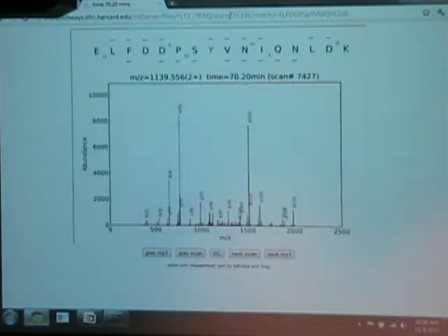Thanks. Can you distribute data with this too? Or is it just for viewing in like a browser? So one mode, a functionality that is disabled or not implemented right now, is this: when you're looking at a raw file, let's say we're looking at some scan. If we go up a level, if you select this, it will make a report of every scan in the file, which will take a bit of time. There you go. So these are all of the scans, links to all of the scans.